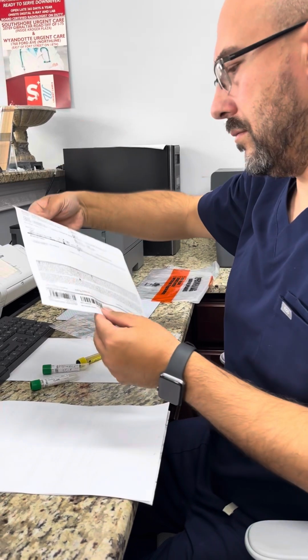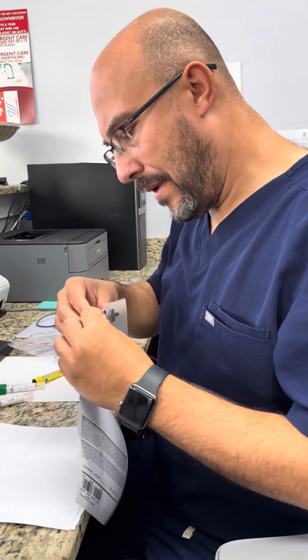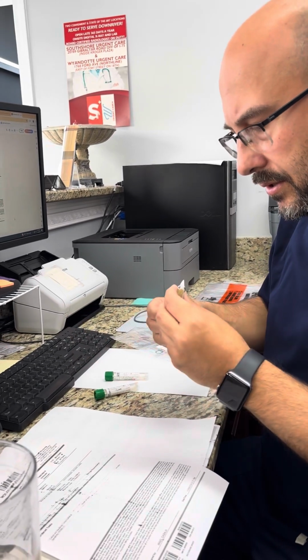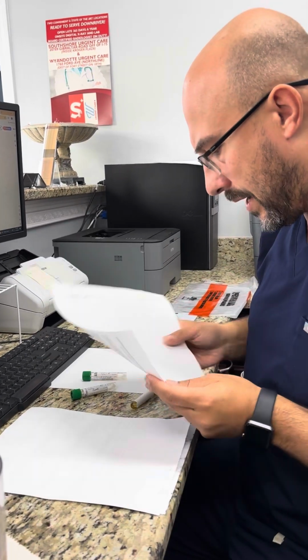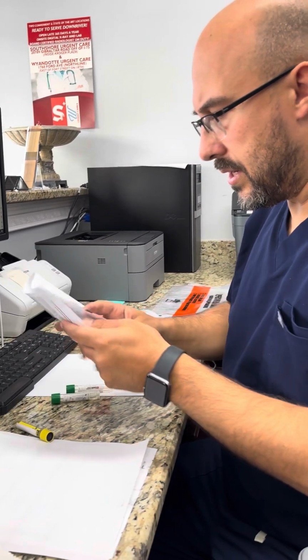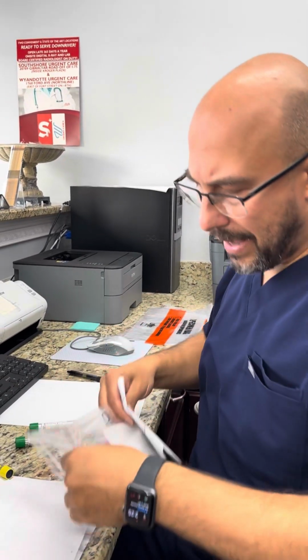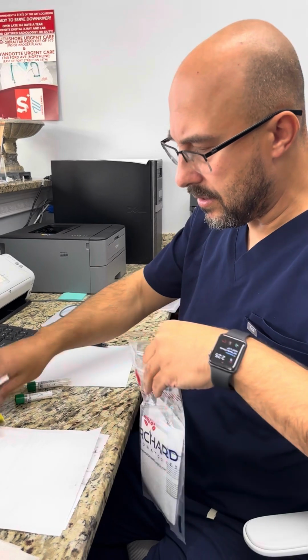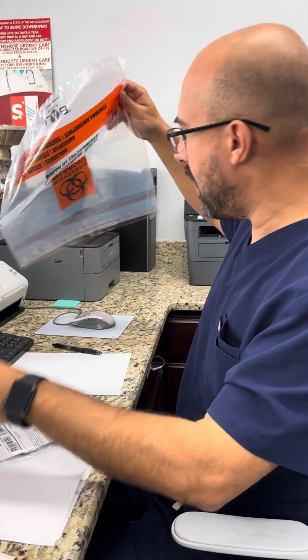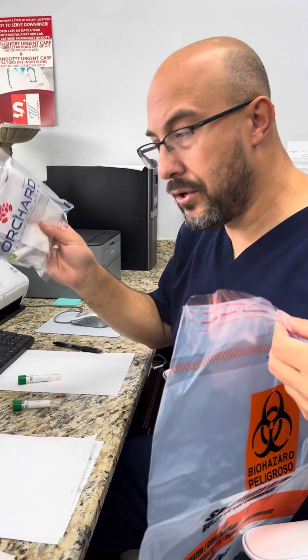All right. So we definitely screwed it up. But I'll fix this in a minute, just to show you how this is done, you want to just put a sticker with the barcode on here. You want to get this along with basically the demographics. There's a little pouch in the front of the bag, put that in there. Get the sample, put it in here. And then all the ones you get throughout the day, you want to throw them in a large bag. I recommend the PCRs are put in a separate bag and all the urines are put in a separate bag, okay?